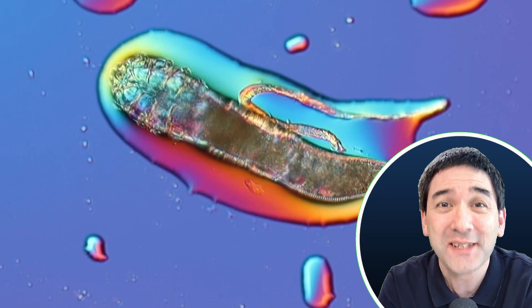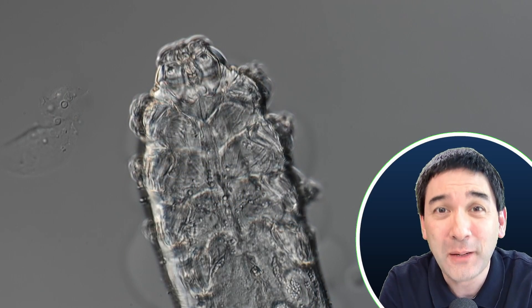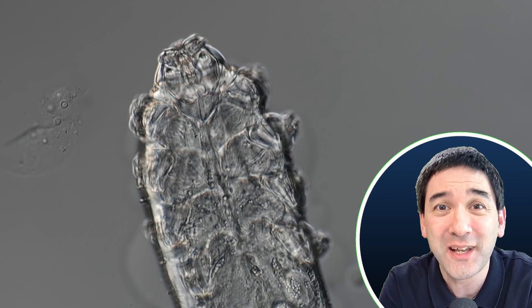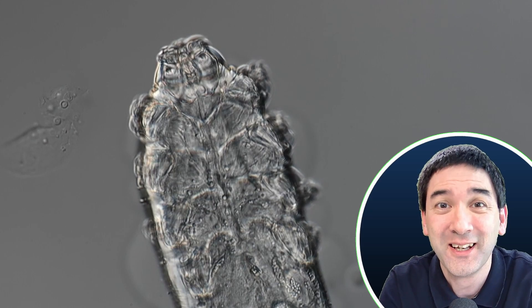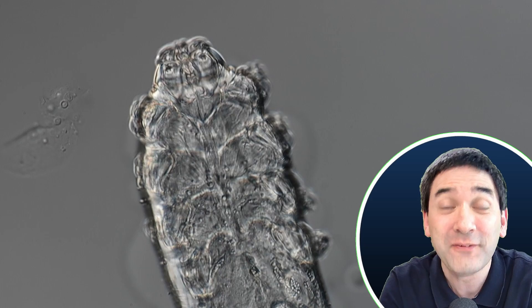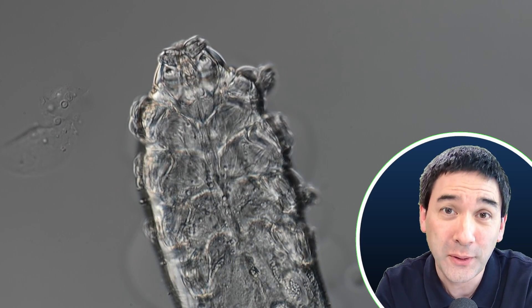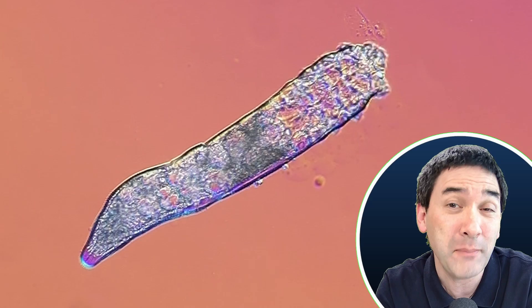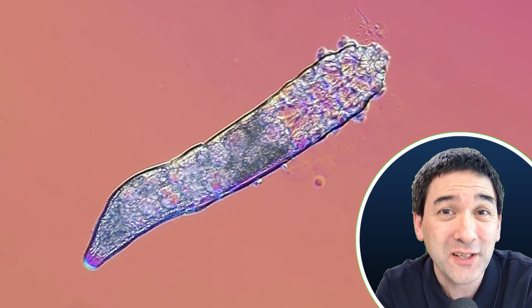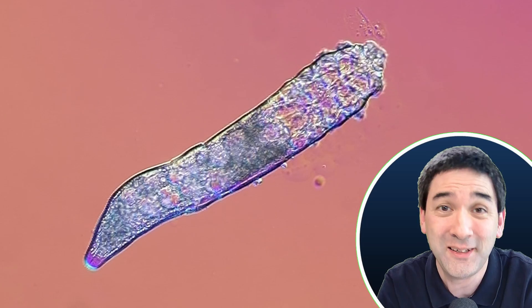I've made already several facemite videos in the previous months, and yes, I keep on coming back to those facemites because they are indeed one of my favorite little animals. I do understand that maybe not everyone might like them, but they are quite fascinating and quite easy to catch if you know what you're doing. With a microscope, they can be quite interesting to observe because they do move around and crawl around on the microscope slide as well.